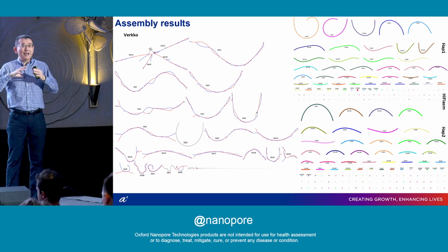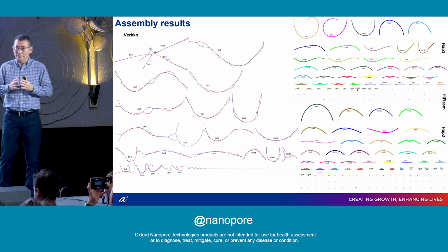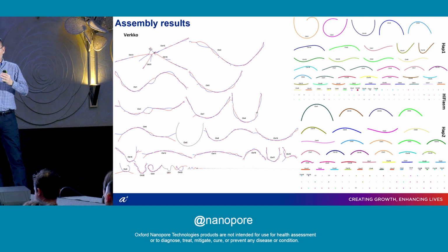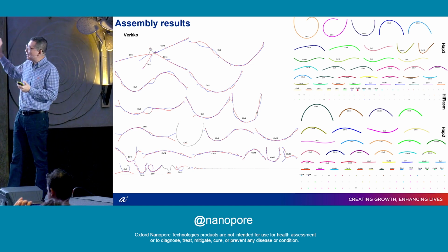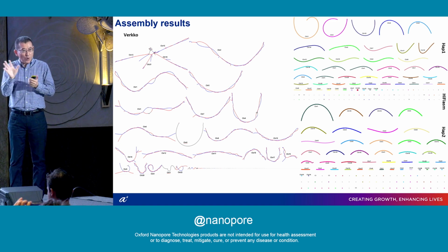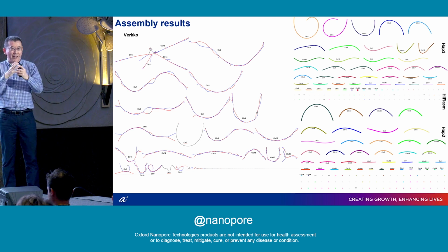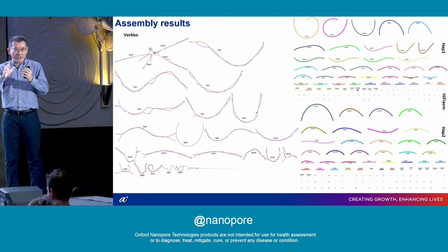The reason is that this is called the rDNA cluster, a sequence that is highly repetitive with multiple copies, probably around 100 copies, concentrated in a certain part of the genome. Usually on acrocentric chromosomes, they're concentrated in a cluster at the tip. These sequences are very hard to resolve. Even at this data level, we are not able to resolve this cluster sequence. That's why these chromosomes are all put together. They cannot figure out which sequence comes from which chromosome.